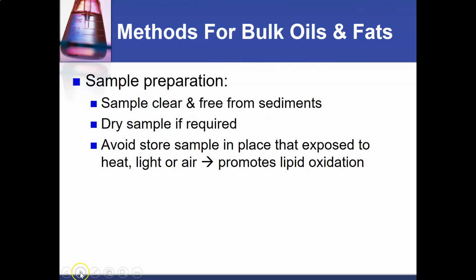So sample preparation, all samples must be clear and free from sediment. And then if needed, we also can dry the sample. And also, as I mentioned before, we really don't want any oxidation on the sample, so we shouldn't expose it to heat, light, or air.